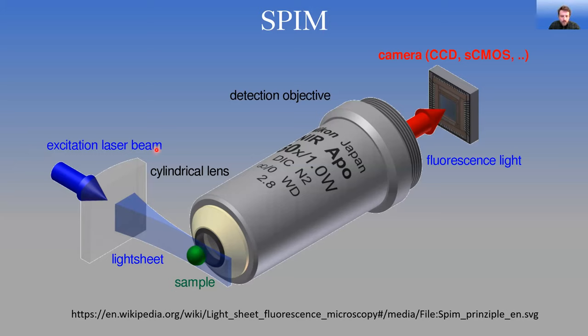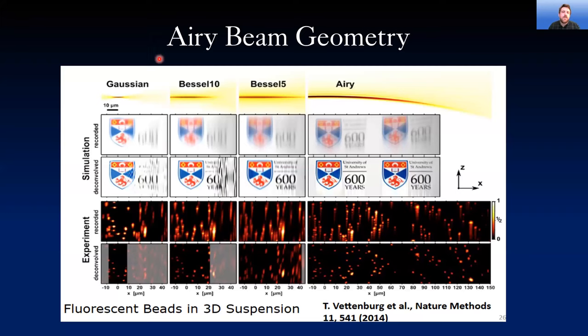So our systems use an Airy beam setup. What is an Airy beam, you might ask? Well, let's just start with how light normally forms. It's usually formed into what's called a Gaussian beam shape. That's just characterized by the mathematical shape that you can record across it.